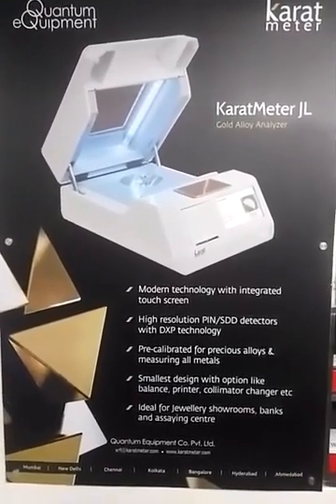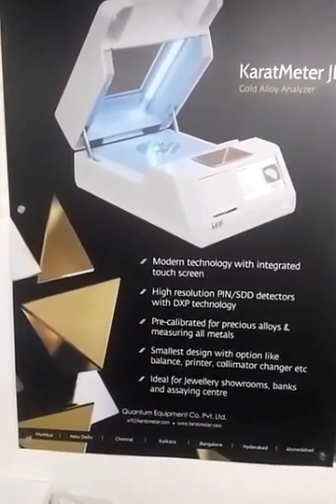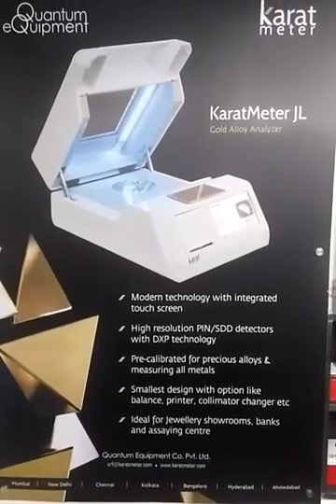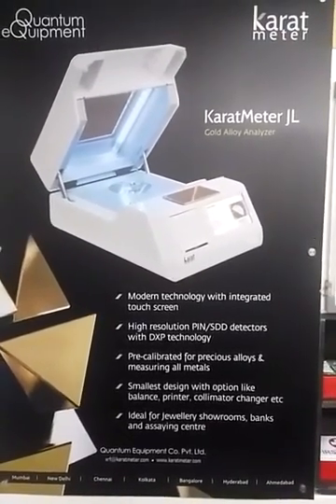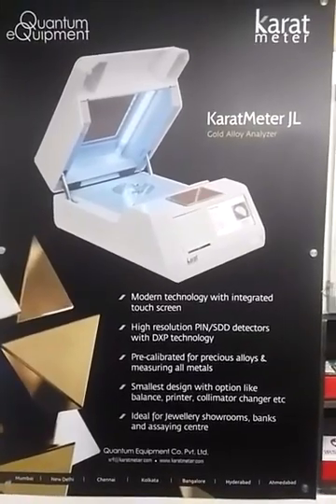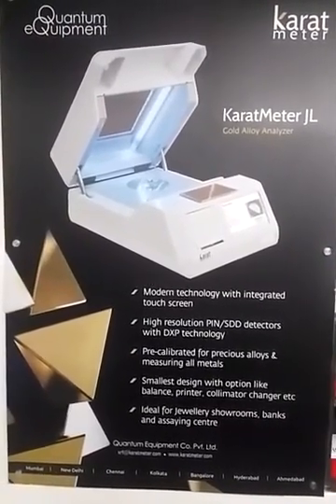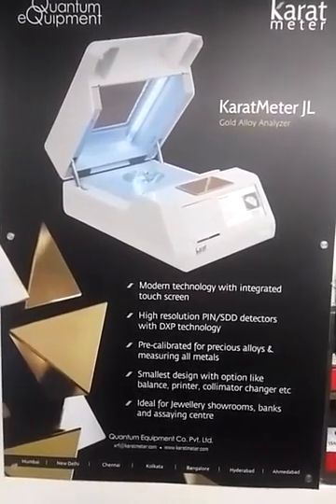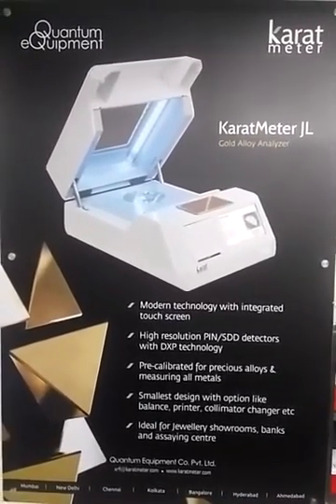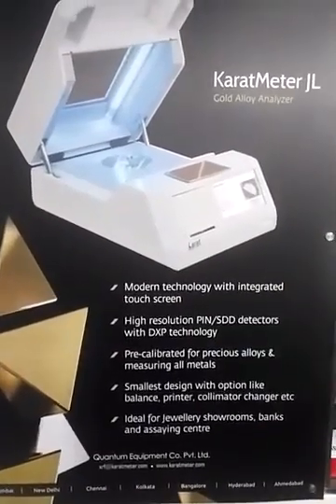Hello, my name is Mandar from Quantum Equipments, Mumbai. I would like to give you a demonstration for the Caratmeter JL. Here is a brief description about the Caratmeter JL.